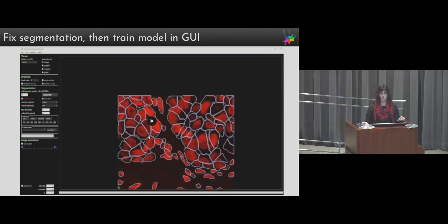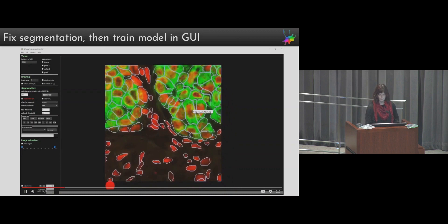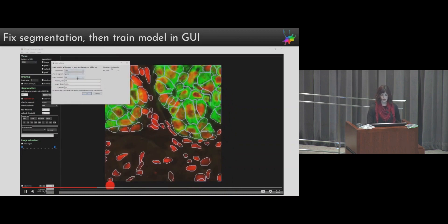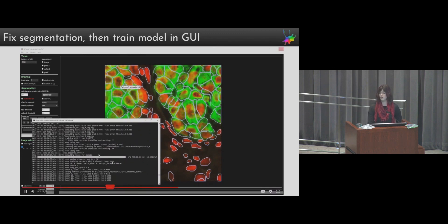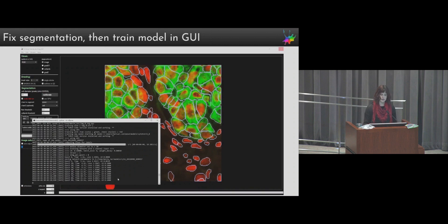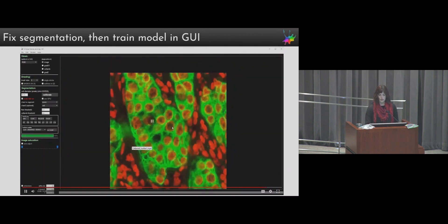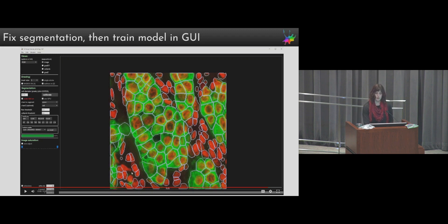Here's how it looks inside the CellPose GUI. The user has run CellPose on an image, corrected it, and is now looking at the corrected image — the nuclei are in red now instead of blue. They train the model in the GUI on just that one image. Training with an RTX 2080 GPU is still pretty fast, and many users now have better GPUs, so training time shouldn't be a limiting factor. Once training finishes, the script loads the next image in your folder and runs the newly retrained model on it. Already after just one image, nuclei that wouldn't have been labeled before — those lacking cytoplasm — are now labeled by the model.